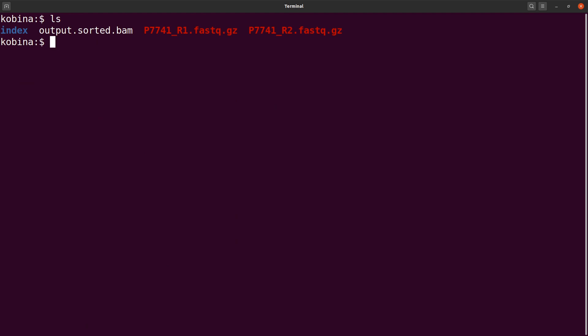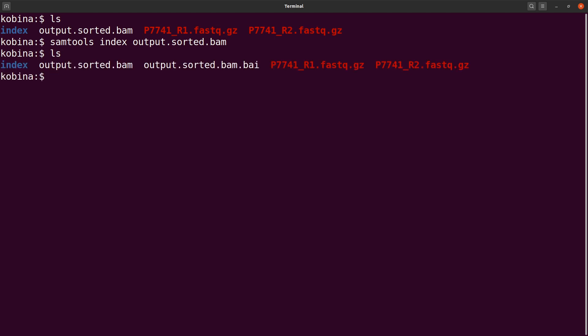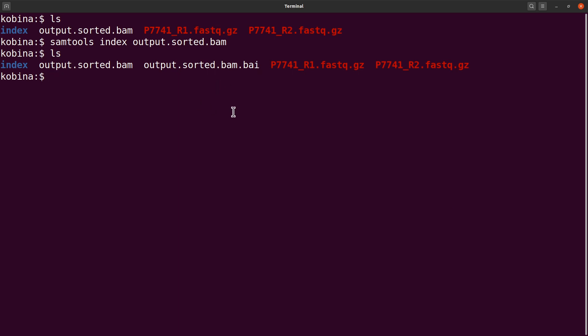Some programs also require that BAM files are indexed. Tools like GATK will require that. To index the BAM file, run 'samtools index output.sorted.bam'. After that, if you do an 'ls', you'll see a '.bai' file, which is the BAM index file.